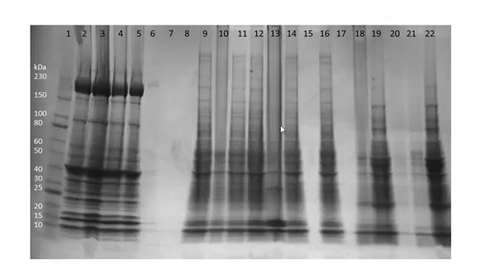So when you're comparing the three homogenates to each other, what you want to do is talk about, first of all, what's the diversity in size range? And so we can see the diversity.